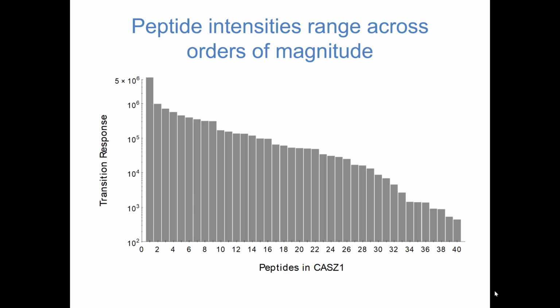Because we synthesize these peptides, they're all equimolar. There's no processing here, it's just in vitro synthesized. So these should all be at exactly the same level, because the last thing we built onto these after synthesis was a GFP tag, which we use for enrichment. So we know we've got full-length protein here.